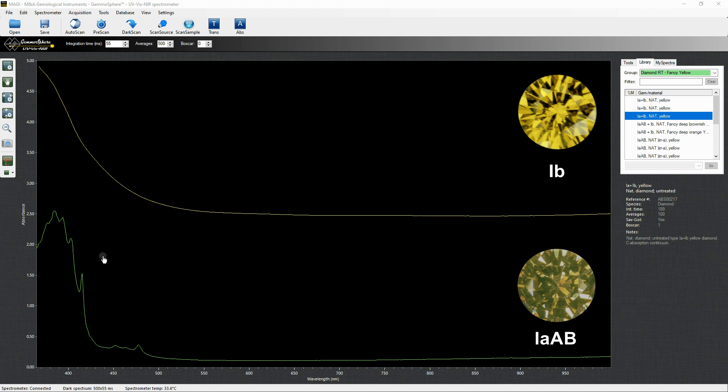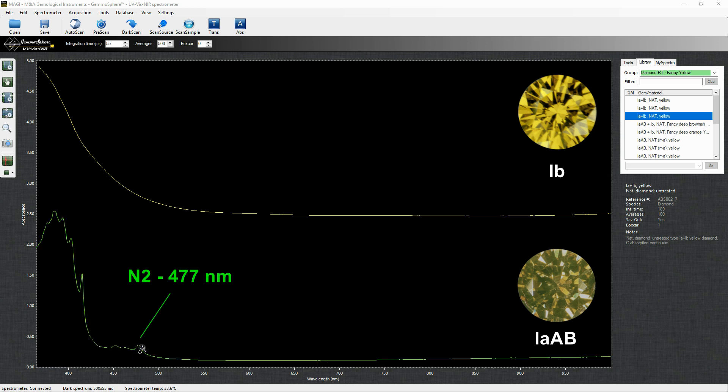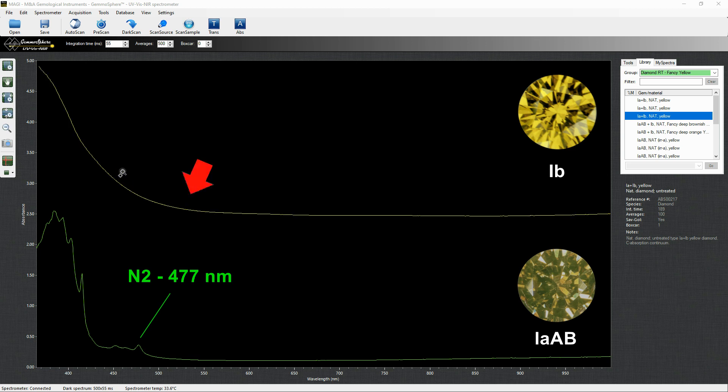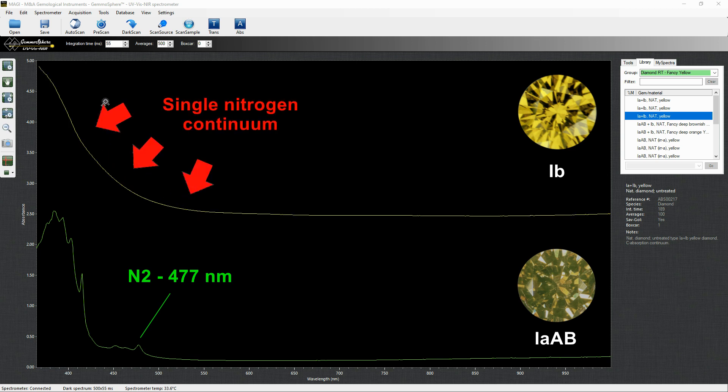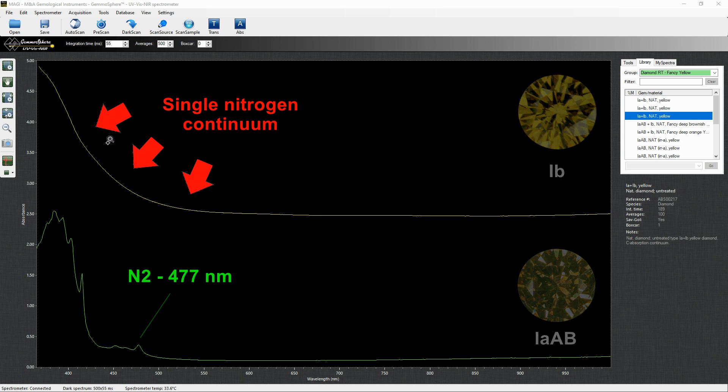The UV-Visnir spectrum is similar to the colorless one. A pronounced N2 peak, which gives the yellow, is an indicator of the high color saturation. Then there are the extremely rare type 1b, which usually display a strong and saturated yellow canary color, caused by single nitrogen. Their spectra features a slope known as the single nitrogen continuum.